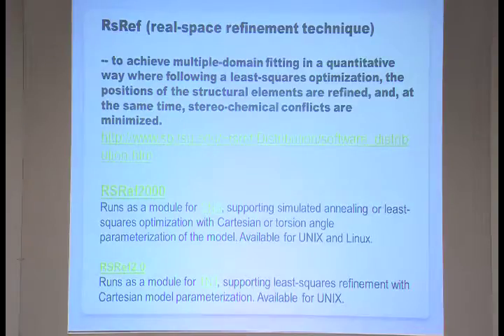Initially it was with TNT, and afterwards with CNS. These are crystallographic programs for model optimization, and RSREF is incorporated using these TNT or CNS modules, because they have all the stereochemical restraints of an X-ray package. Using an X-ray package is really good that way.